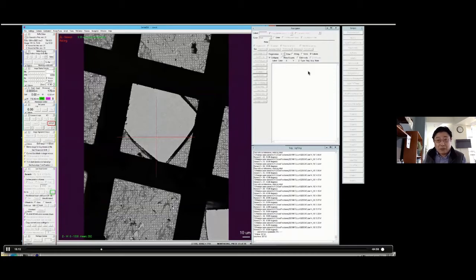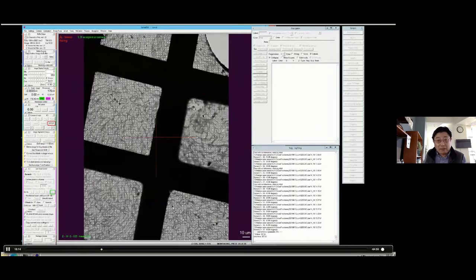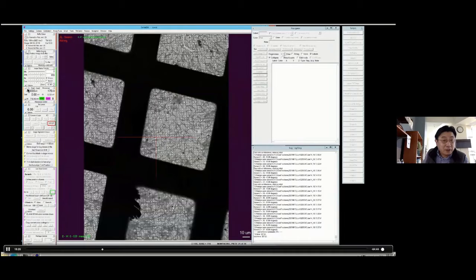As you know, right now nothing's there. But after they finish, the montage file will show up here. And since we are waiting for 2 more minutes, there's a couple of things you may still want to keep an eye on. There's a defocus, and this is a tilt angle. There are many controls of the microscope.